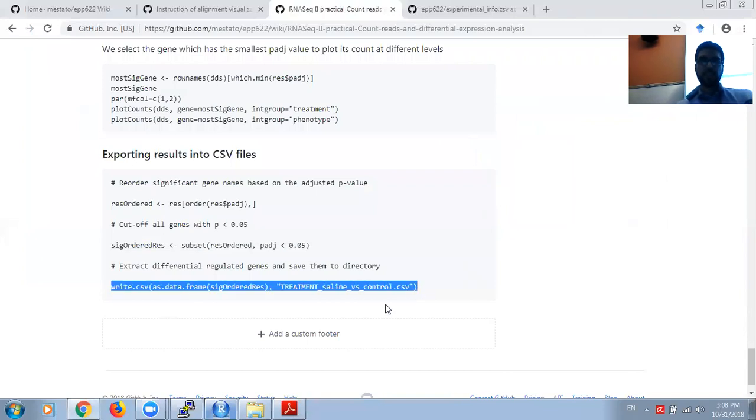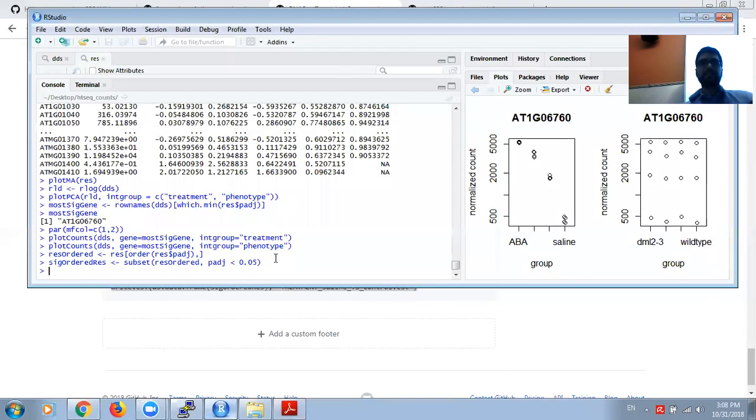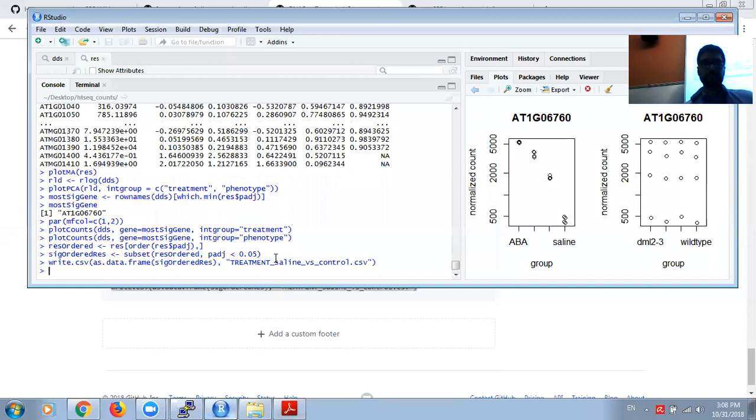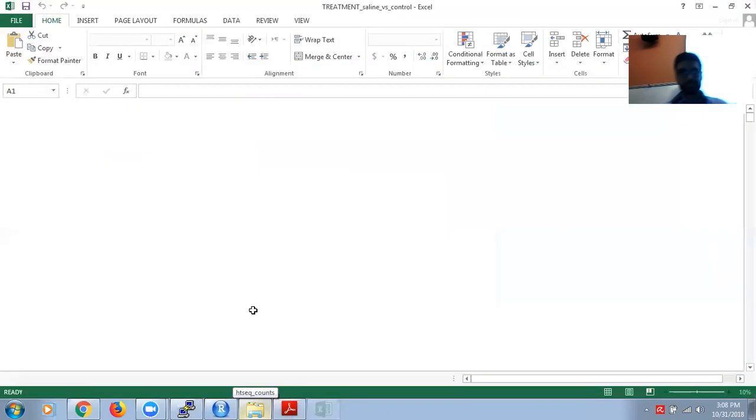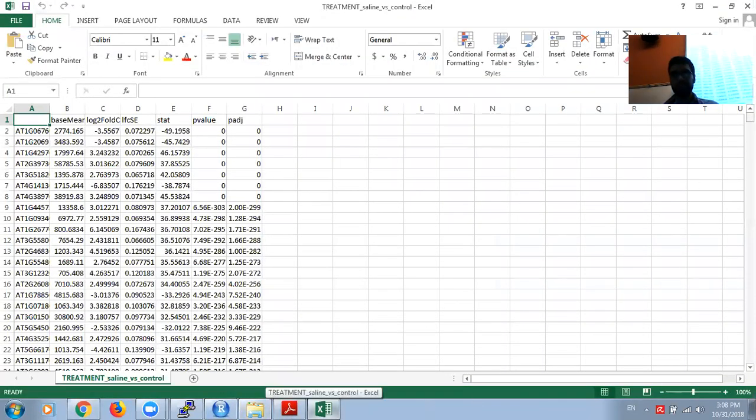And at the end, you get the raw data, the data that's just been caught and filtered, and save it into the directory that you are in now. And if you go to the directory, for example, the one that I get the data from, I see the one that I just created, this one, and you get all the data set.